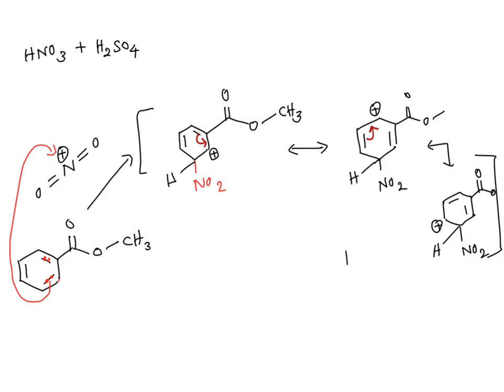right, H2O, take a proton from there, and in the lab we add extra water in the form of ice to do this step, right?